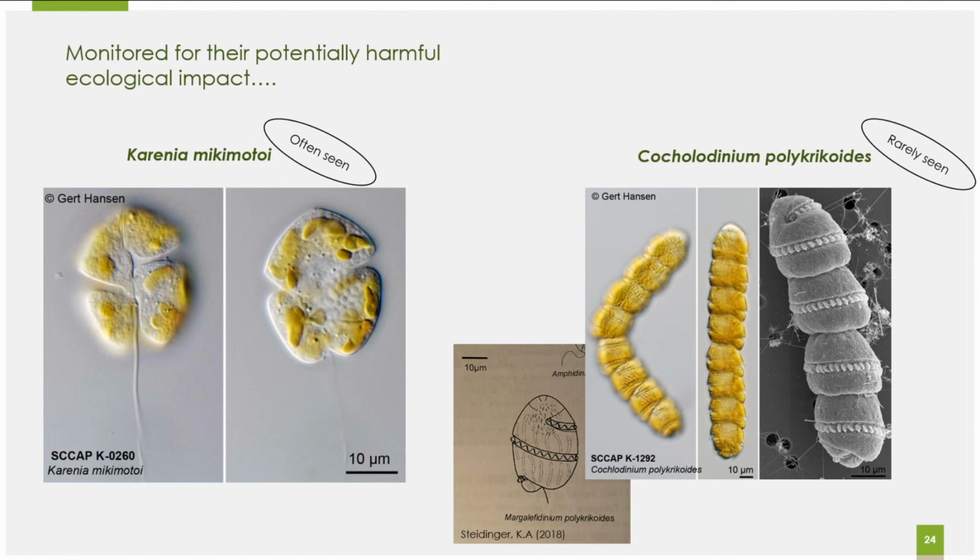They have these yellowish green and brown chloroplasts here. They're rod shaped and they usually form chains. Again, I don't think I've seen one myself since I worked here. That's why I say they're rarely seen. I get reports from Maine and Massachusetts and they haven't seen any either, or at least rarely.